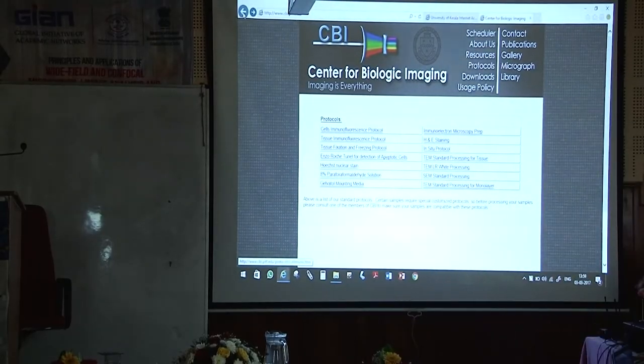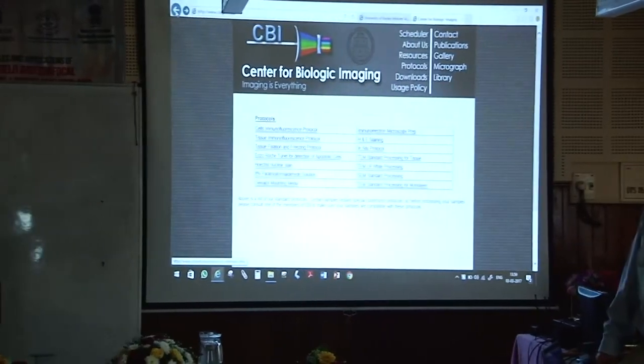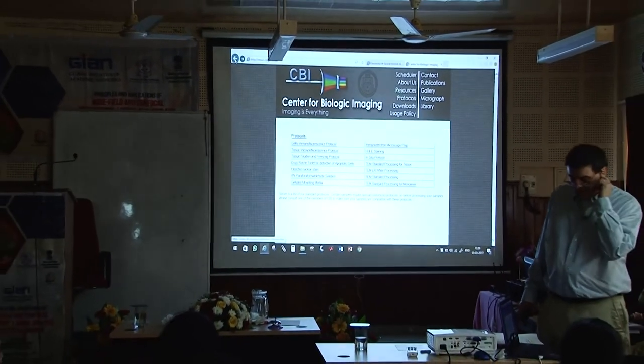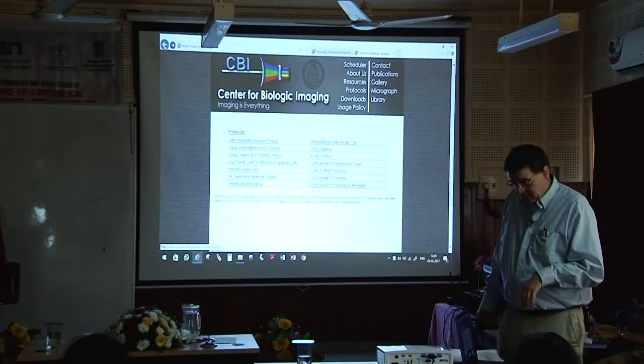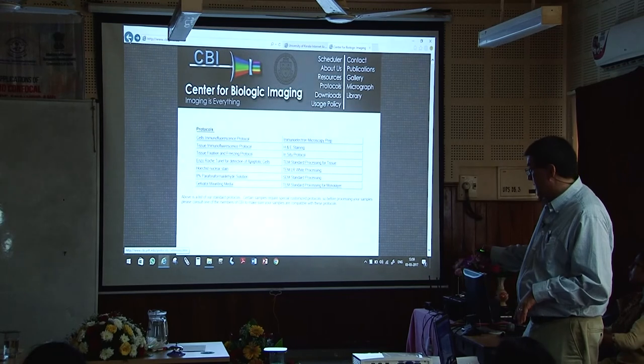So what I'm going to try to do here is, a lot of people have asked about protocols for staining cells and staining tissue. This is a really good website.